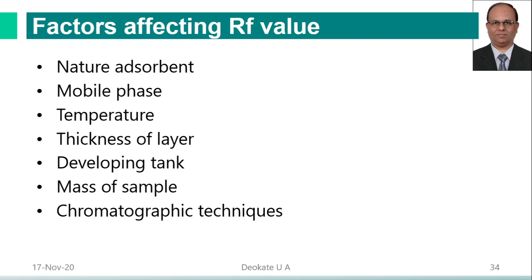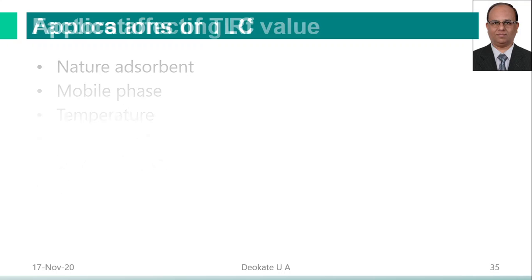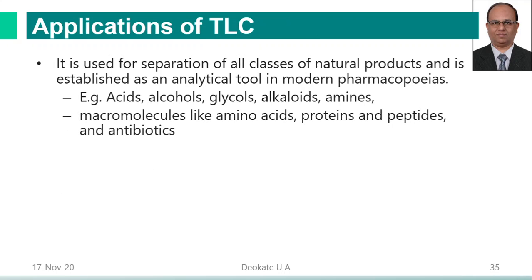Then the last factor is the chromatographic technique. Depending upon the development technique used, that is ascending, descending, horizontal, etc., the Rf value changes for the same solvent system. Therefore, it is essential to spot the sample and the reference together on the plate so that we can identify the unknown. Application of TLC.